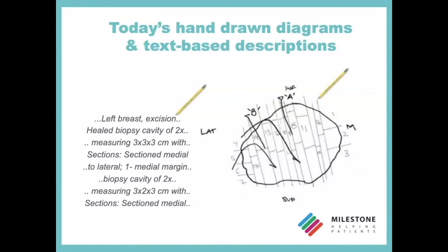Currently, the most common procedures are based on a text description of the sample that is from time to time also combined with a hand-drawn diagram. This helps to obtain a better characterization of the tissue that obviously is not so easy to describe with words only.